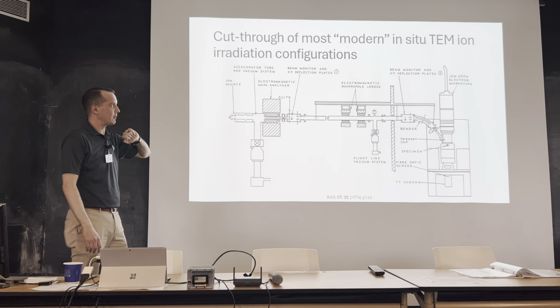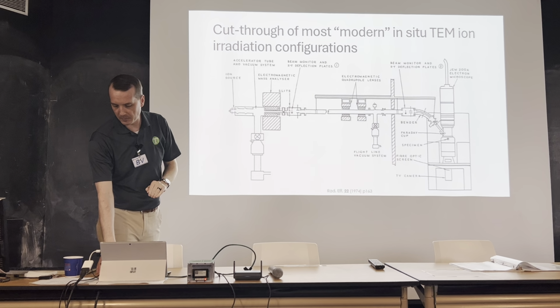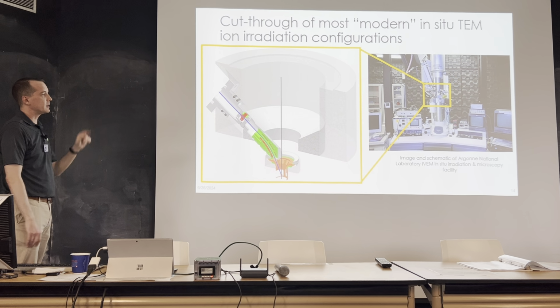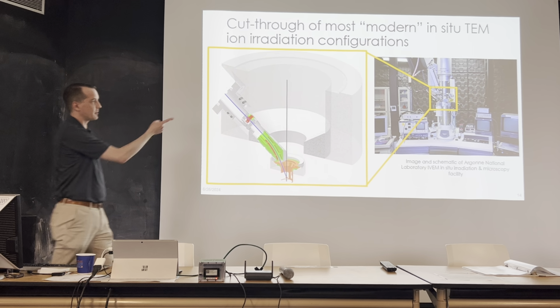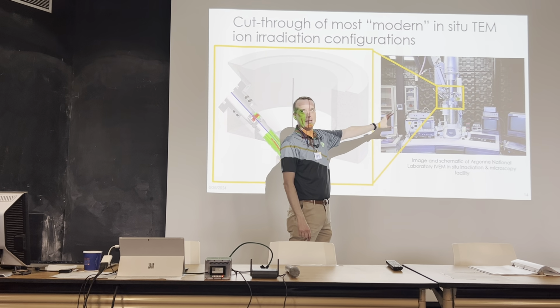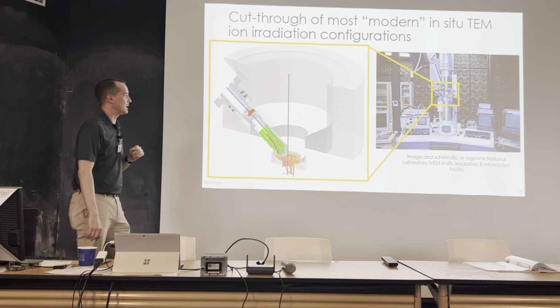This is what's on the end of it. The microscopes have gotten better. You're no longer developing film, you have digital images that you're taking. This one is actually at IVEM, which we'll call a sister facility over at Argonne National Laboratory. We've hooked up to this system, but you can see you have a variety of different decades of technology being coupled together for these instruments and these systems.